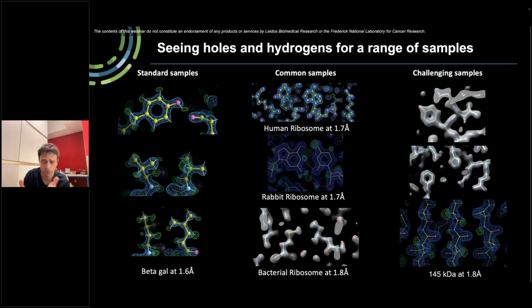The other thing is that with the ribosome, and also with any specimen, one of the concerns is that you do your best to potentially try to lock the particle into one shape, but with the ribosome, that's not always possible, and there's always kind of unforeseen things. And it turns out that if you have this conformational heterogeneity, obviously nowadays with the different computational methods, there's various ways to still get the high resolution. But with the ribosome itself, if you have a bunch of different states, you can still get to high resolution, but for multiple states.